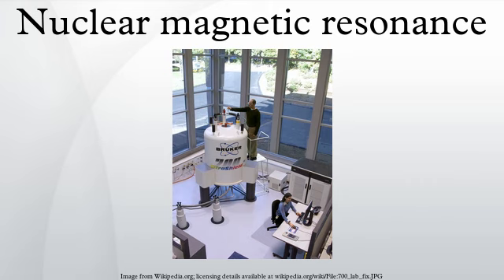14N, spin 1, medium sensitivity nucleus with wide chemical shift. Its large quadrupole moment interferes in acquisition of high-resolution spectra, limiting usefulness to smaller molecules and functional groups with a high degree of symmetry such as the head groups of lipids. 15N, spin 1/2, relatively commonly used. Can be used for labeling compounds. Nucleus very insensitive but yields sharp signals. Low percentage in natural nitrogen together with low sensitivity requires high concentrations or expensive isotope enrichment.